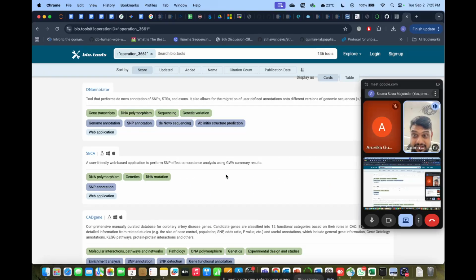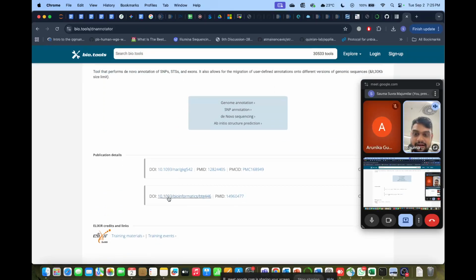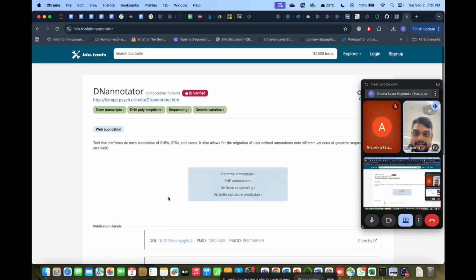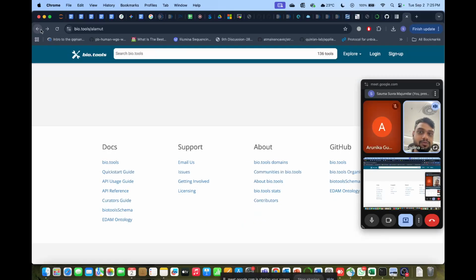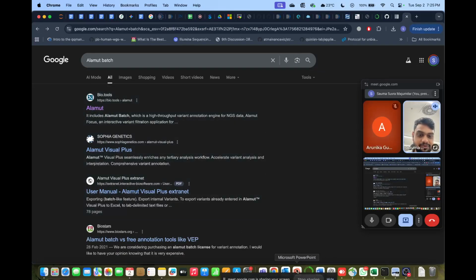I think you need to buy or take a subscription for this. Then you can run. This is not exactly free, but the other two, ANNOVAR and VEP, are free. So those two are more widely used.